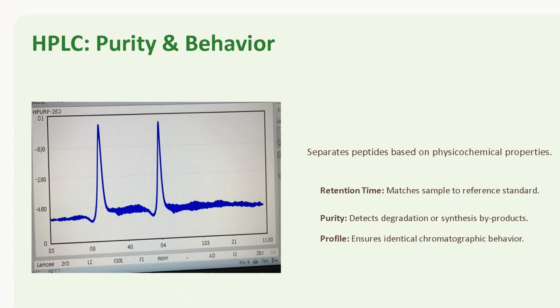HPLC also helps detect impurities, degradation products, or synthesis byproducts, ensuring that the peptide sample maintains a high level of purity.